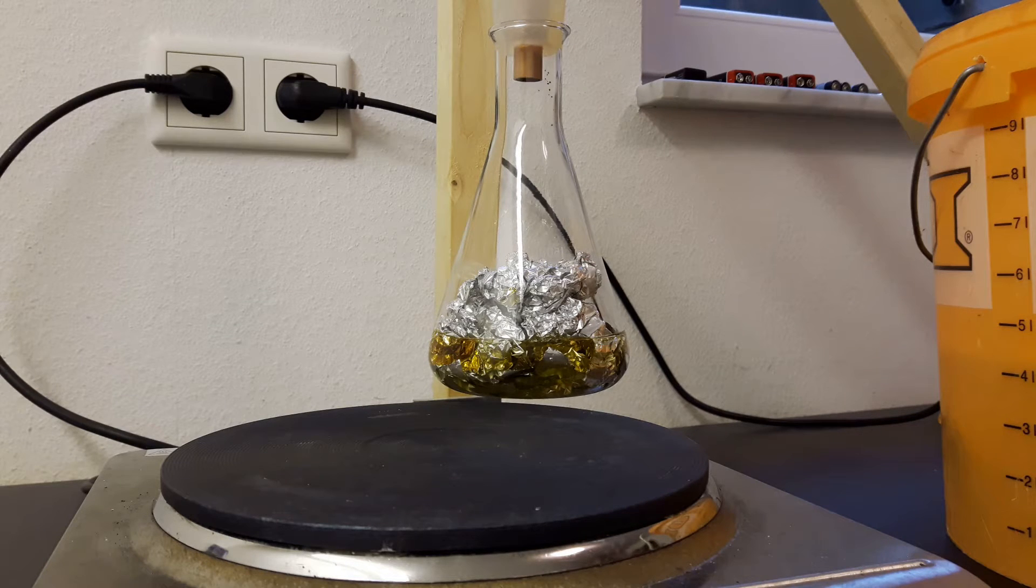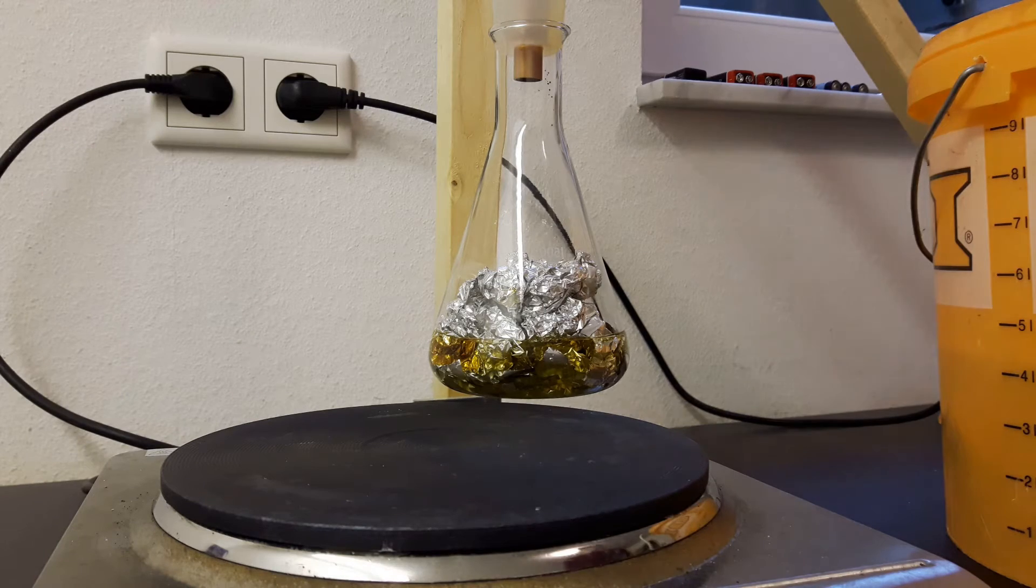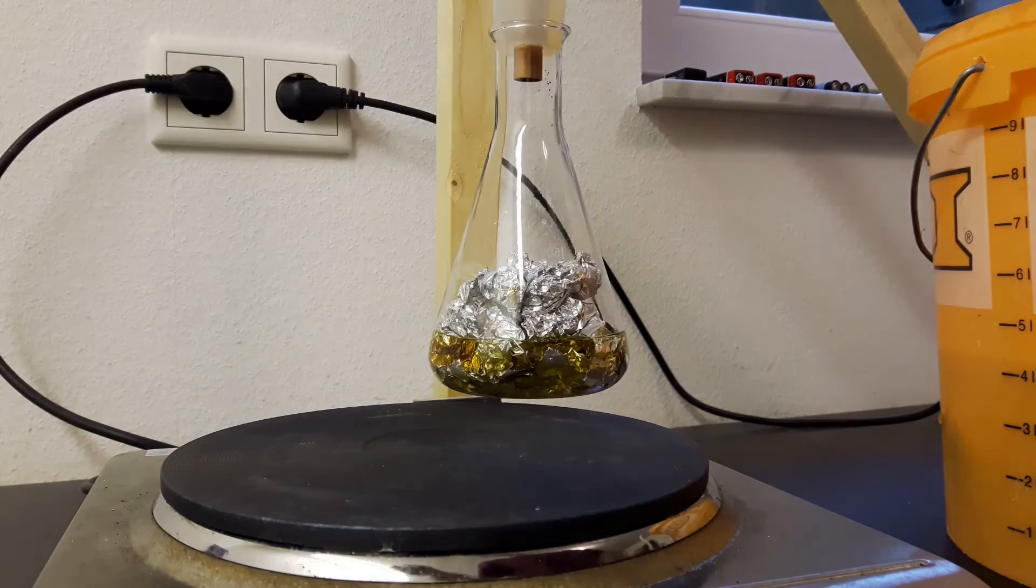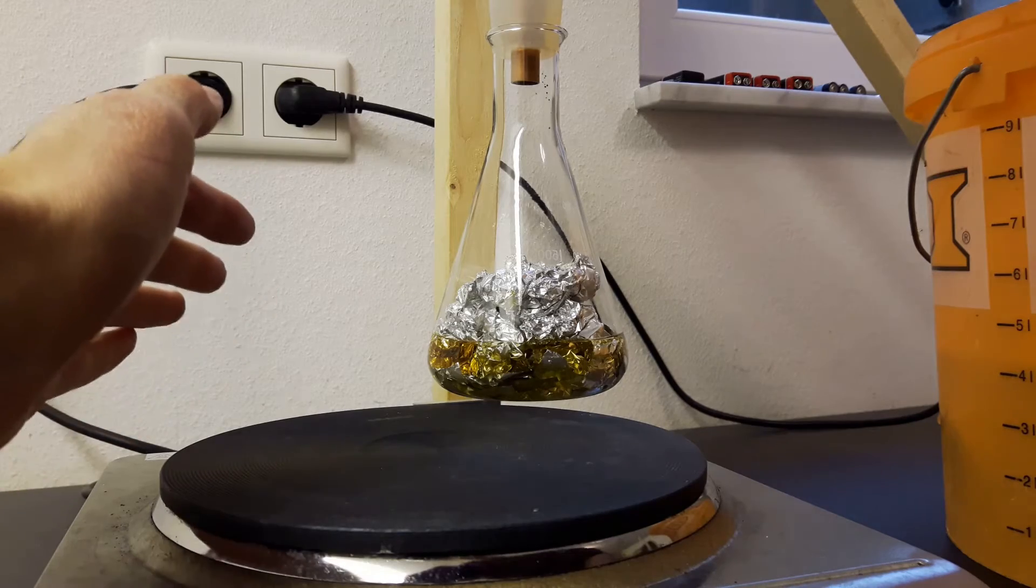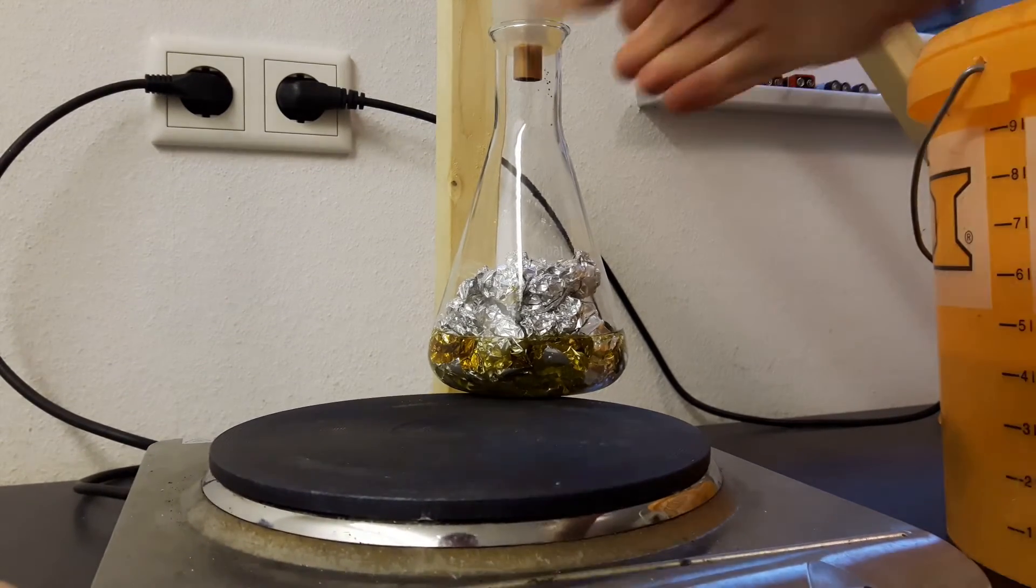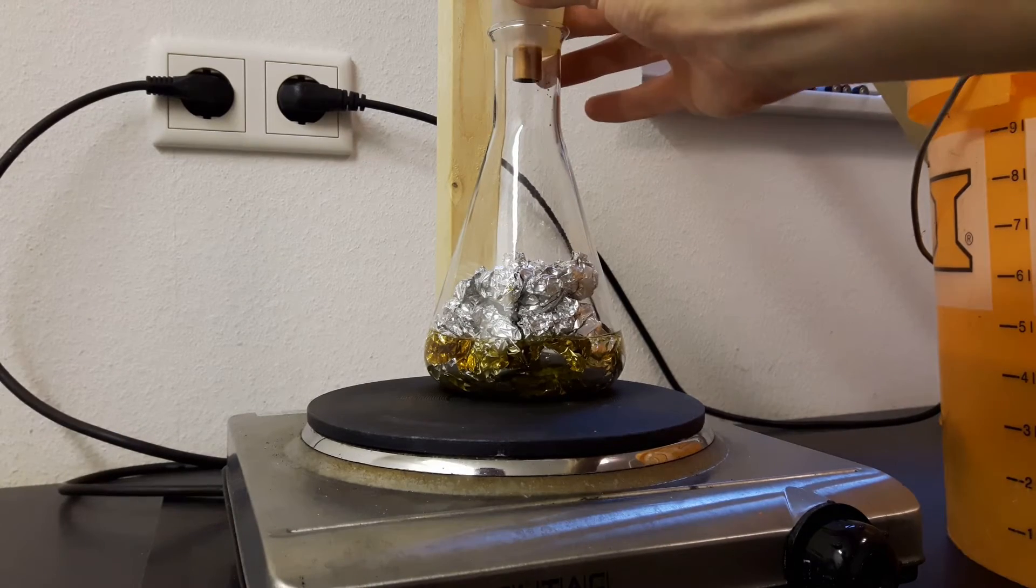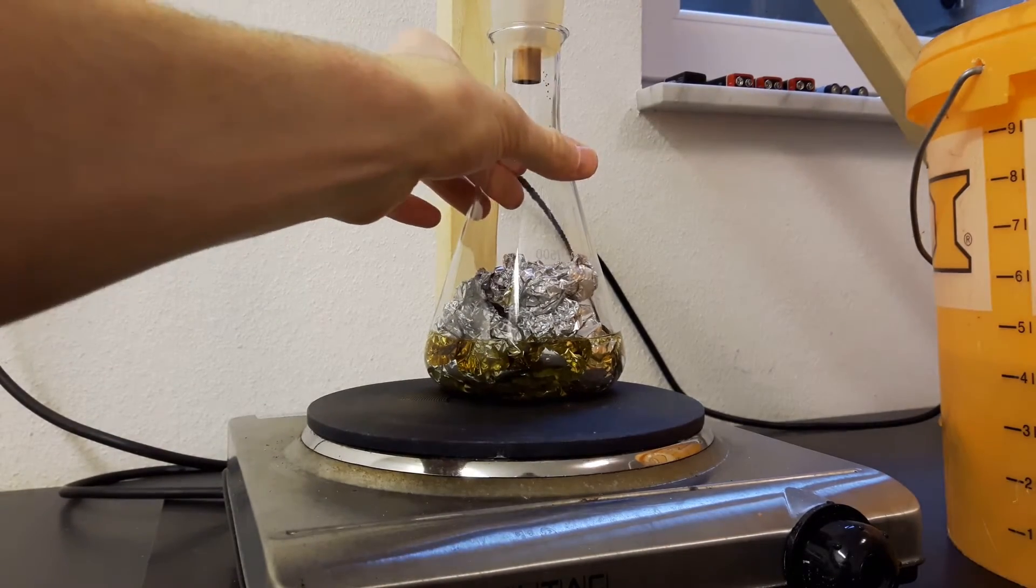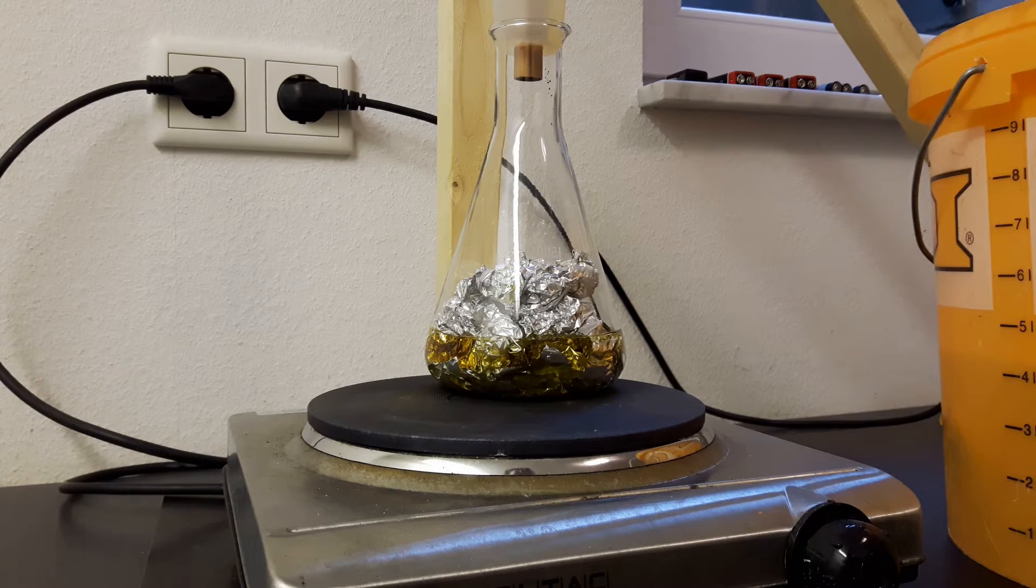Because the components like aluminum isopropoxide are pretty expensive. They are not available on eBay. So you can get them from chemical suppliers but it's not easy for a private person to access these chemicals. As well as aluminum chloride anhydrous it's pretty difficult to access and currently I have no option. So I have to do a lot of things at home with domestic chemicals and this is really a huge pain. Because it needs so much time and I always do very big quantities. Because if I ruin the synthesis later I still have some backup material to do the synthesis again. Because otherwise I would end up doing this for years.